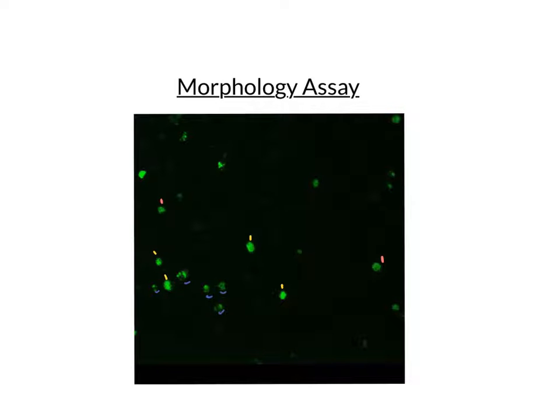This picture above shows the morphology assay after 12 hours. Now there was a previous assay of 24 hours, but the extract's effectiveness was better than expected, with very little to no cells left.